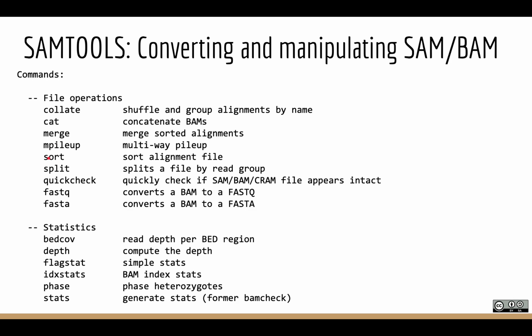A FASTQ file, those DNA sequences in the FASTQ file are in completely random order. I mean, you've taken 1 million cells, you've lysed them, you've put transposase in there, you've put adapters on all the molecules, and then that gets put in a tube. You then pipette that onto a flow cell, and those molecules are just scattered randomly across the flow cell. The sequences that you get in your FASTQ file, I think they start at the upper left of the flow cell and are just reading out sequences in order on the flow cell, but essentially with respect to the reference genome, they're all in random order.